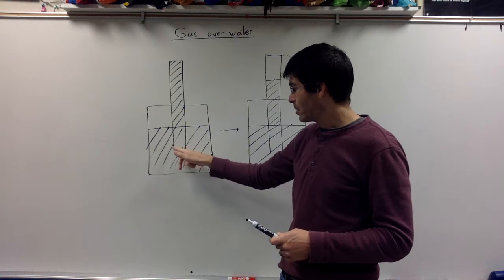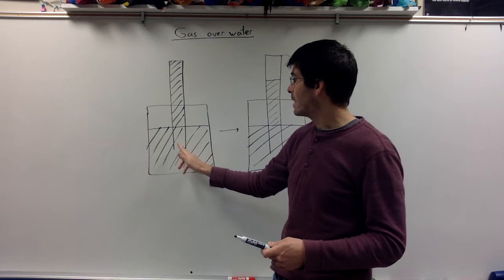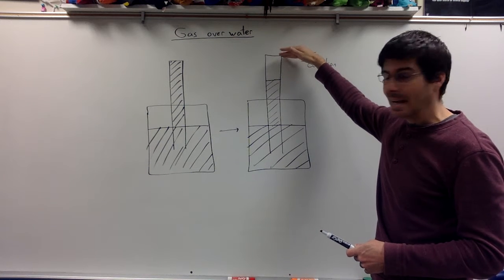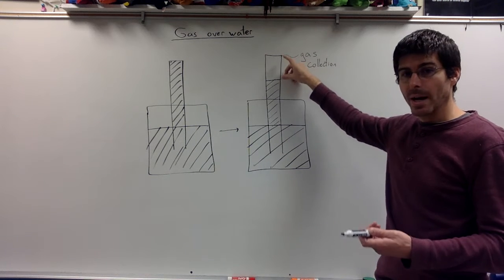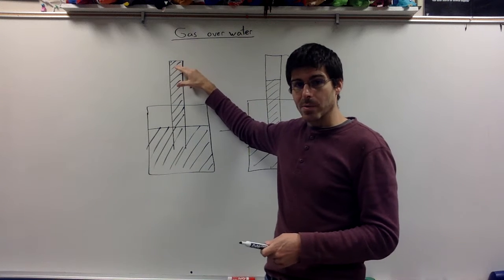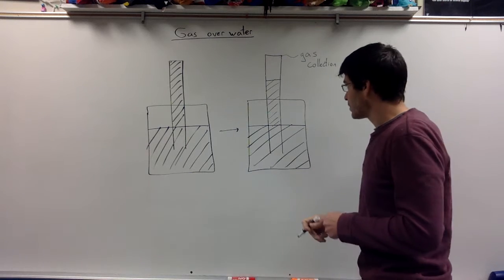And you can get a reaction to happen or bubble a gas into this test tube, and the gas will rise to the top. As that gas collects, it pushes down the water and isolates the gas collection. So this is a clever way to isolate your gas. And since there was no air in there before, we know there's no contamination. What you get up here is just your gas, but not quite.